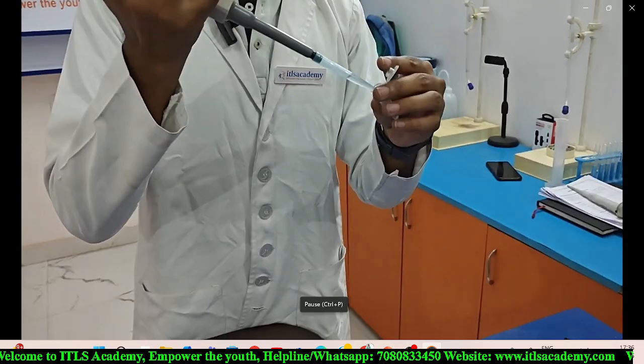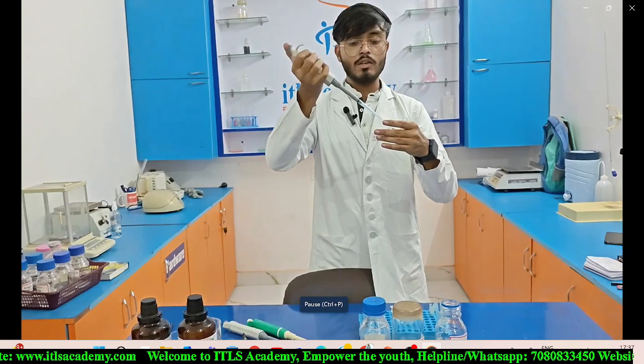Now the very first step is we need to pour 0.5 ml of TE buffer in each of the eppendorfs, and for that I set 500 microliter on this. Now with the help of a micropipette, take 0.5 ml of TE buffer and add it into each eppendorf, and by the same measurement we need to add this buffer solution in each eppendorf.